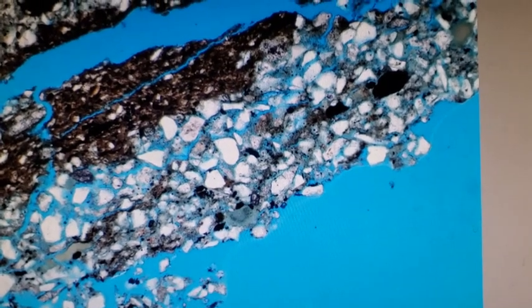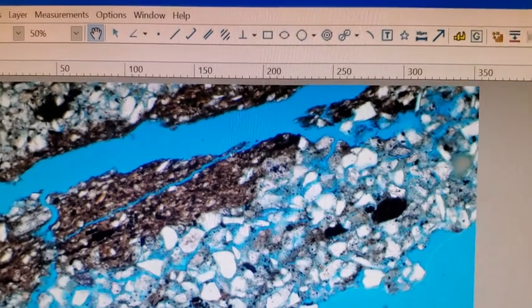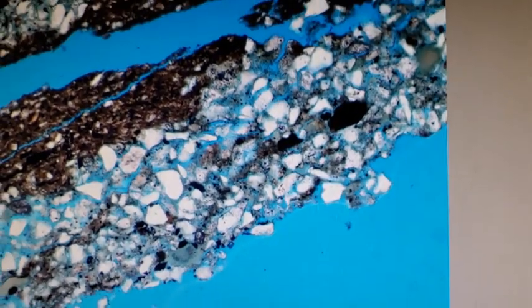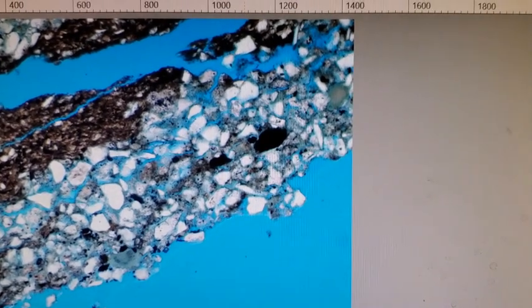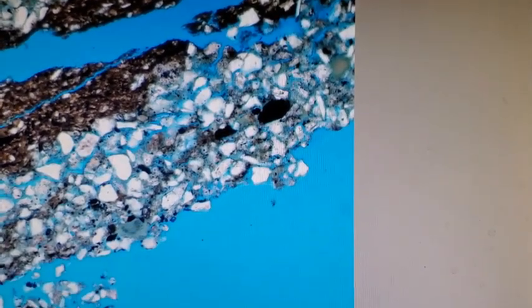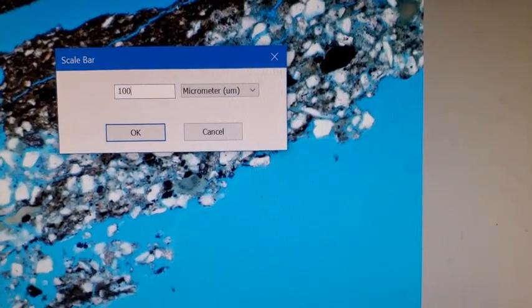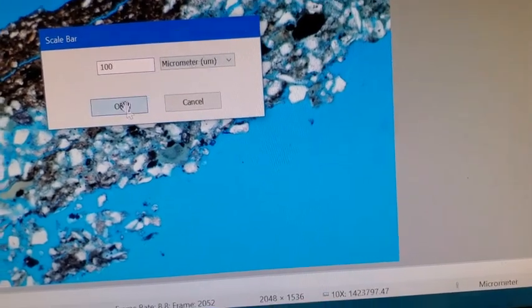fluids are stored. All right, and I have to go look at my microscope. This is 100 times magnified. I'm not sure whether I can show you what that means, or maybe I can. Let's see. I go to 100 times on this thing, and then I put a scale there of 100 microns. All right. And there, that is 100 microns.